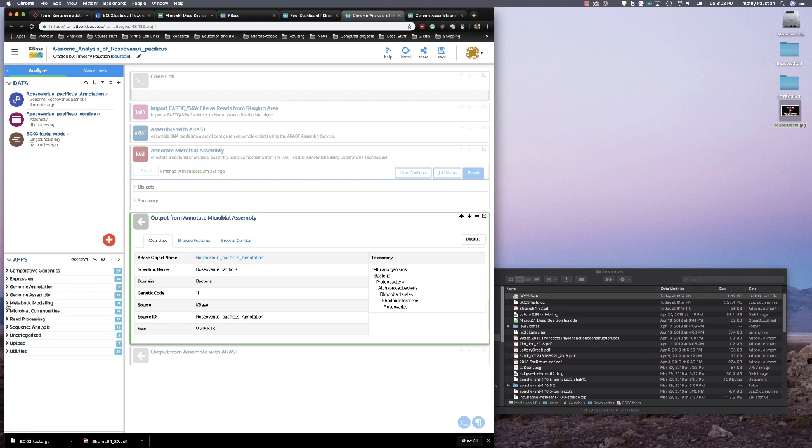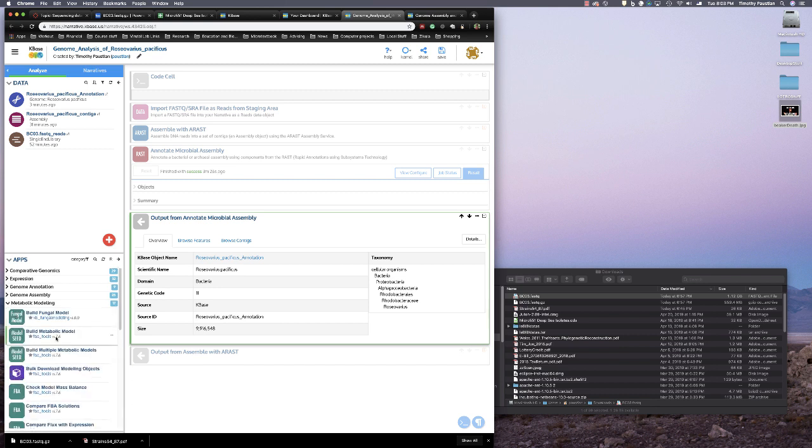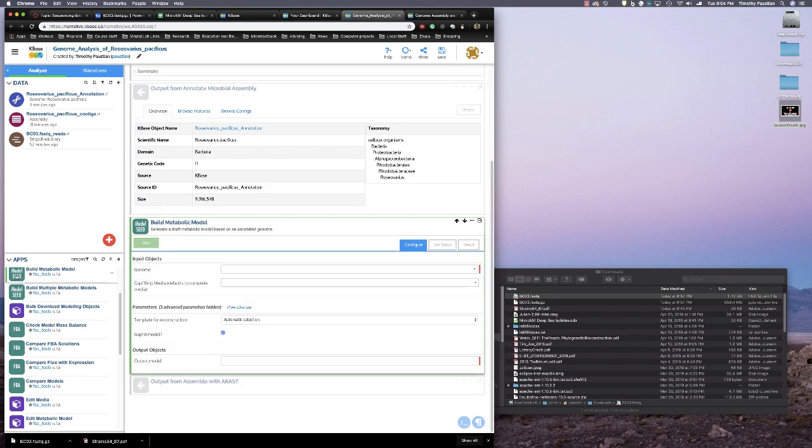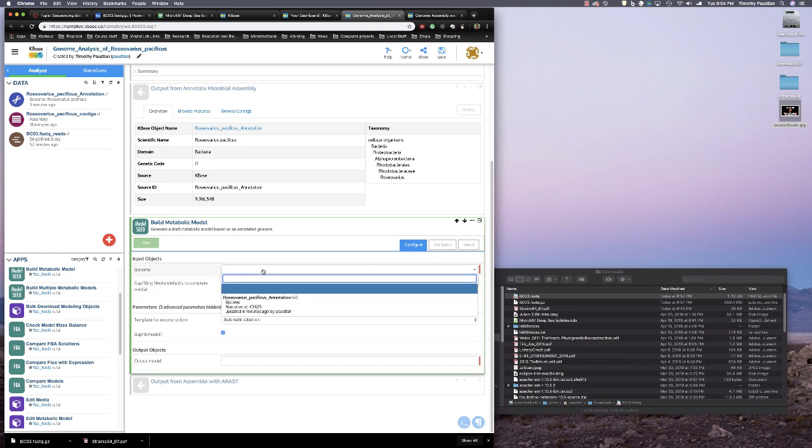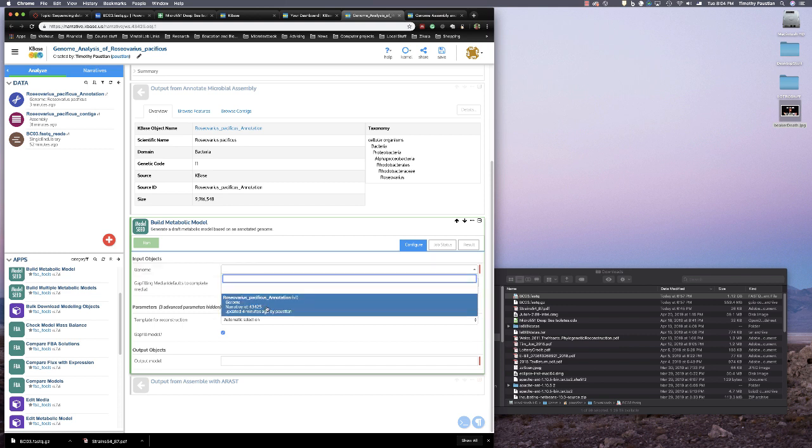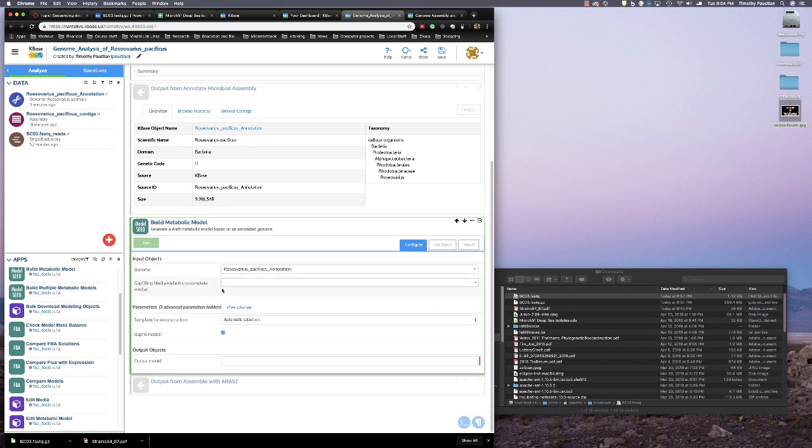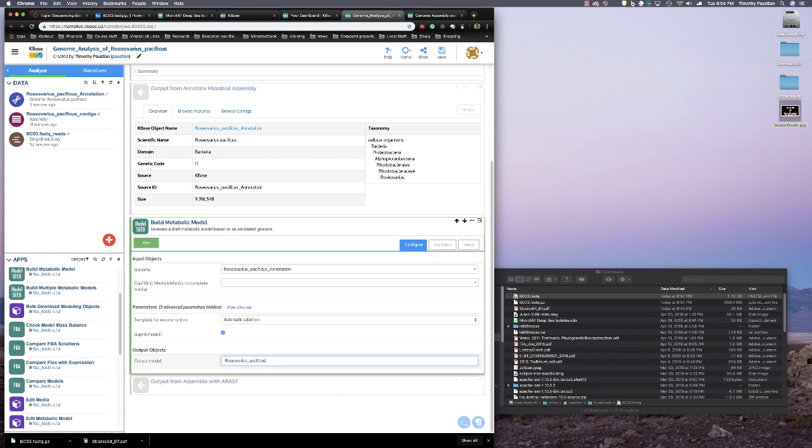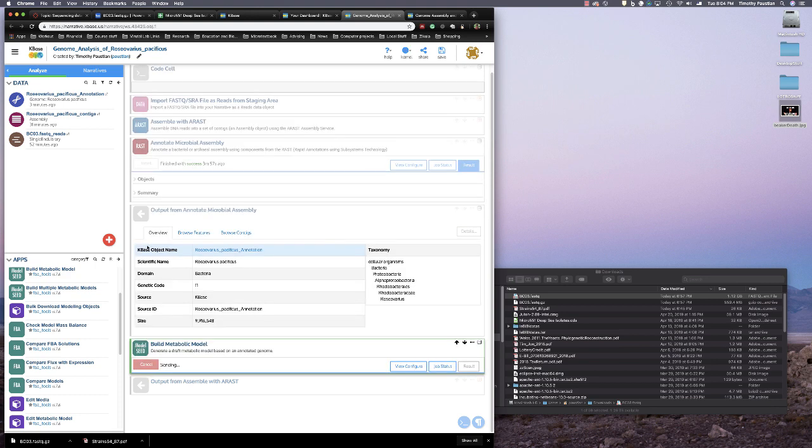So if you go to the apps, metabolic modeling, and you go to build metabolic model, and again, we'll choose the genome, and our genome is going to be the annotated Roseovarius pacificus genome. And then again, just leave the advanced where it is, and again, we'll put down Roseovarius pacificus, and we'll call this MM for metabolic model. It's all ready to go, and you hit run, and it goes and it sends it again, and off you go.